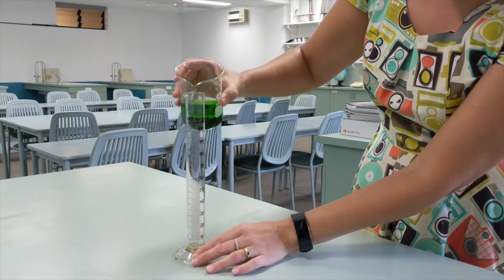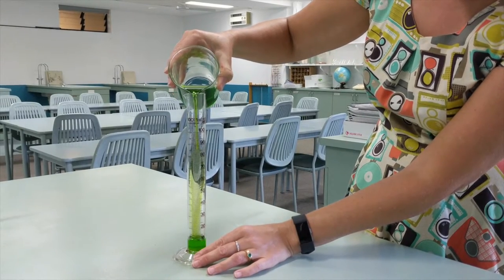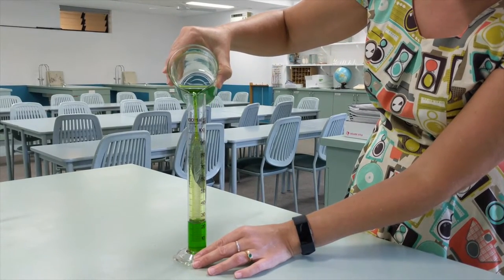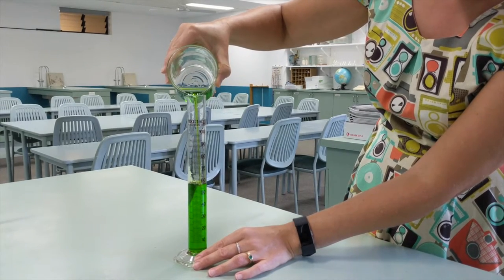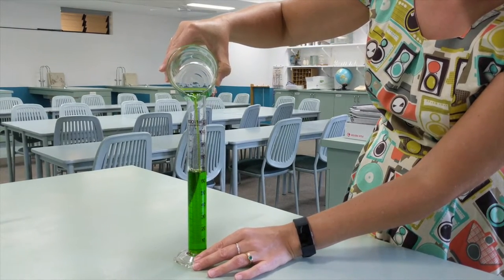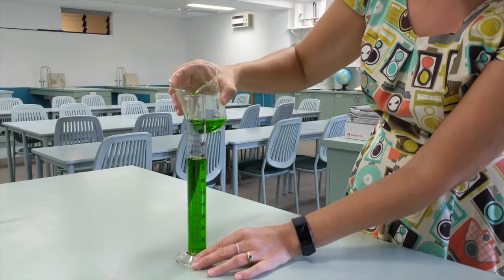Then slowly pour it into your measuring cylinder. You want to pour slowly to avoid any splashes. Pour it in until you've got about 80 mils, about the volume you want.